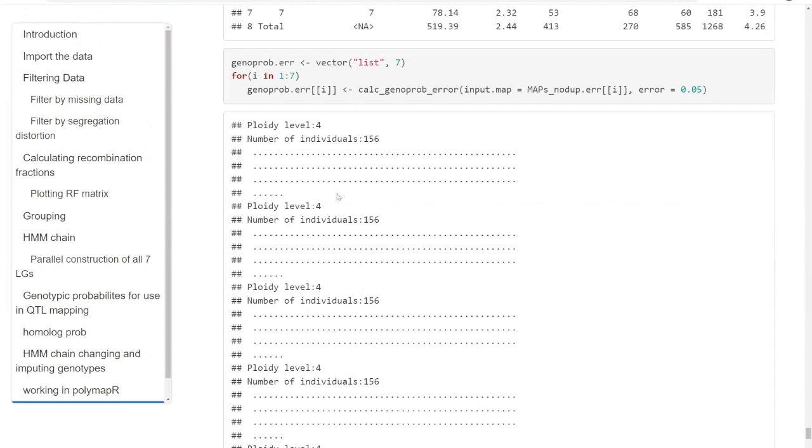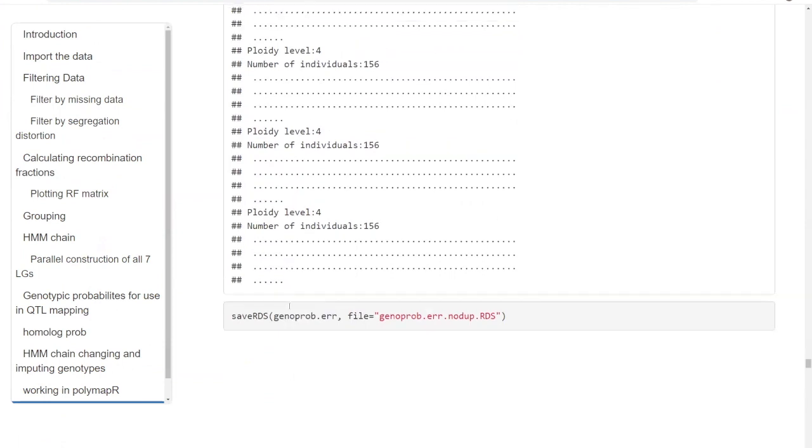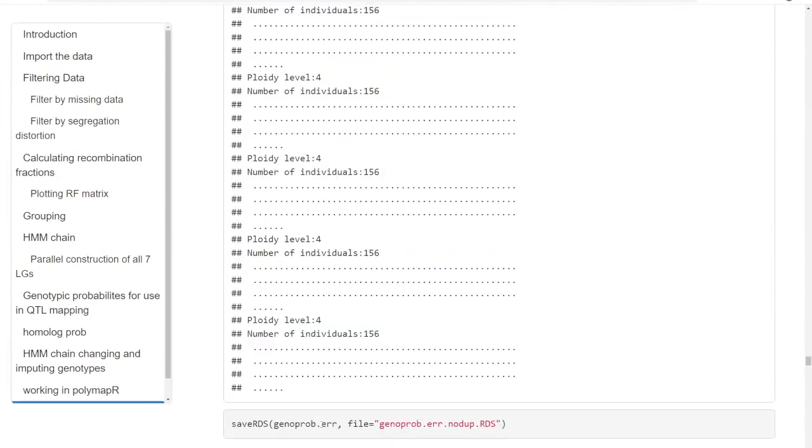Now, next week, we're going to take output from that last step. If you want to carry on on your computer for next week, you're going to have to run that big chunk of code and get this object. It will be saved in that folder, and it will be used next week. However, I think we can also just provide the object, so you don't have to run it, and that would be easier.